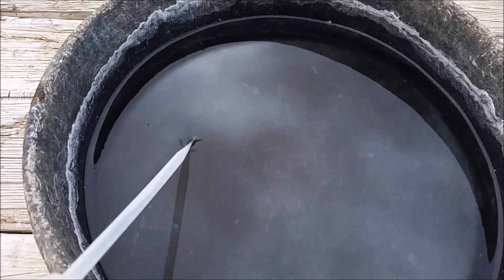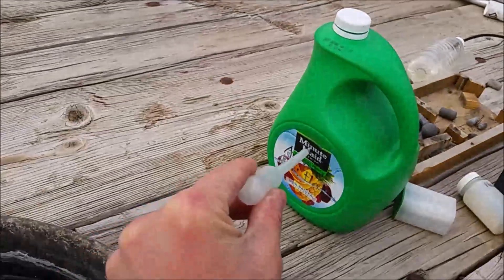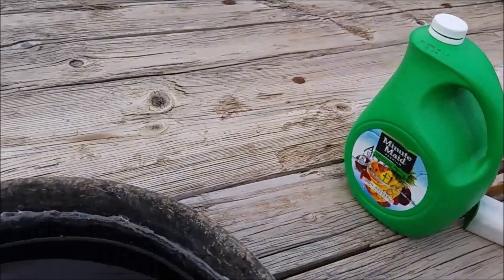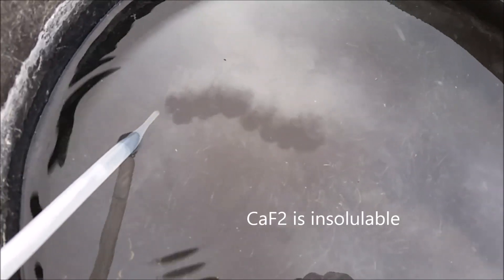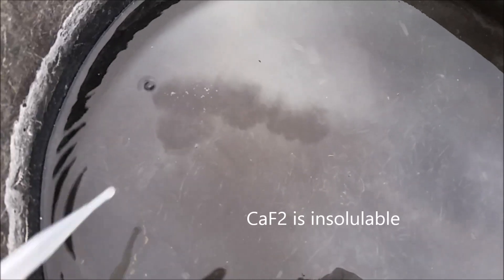You can see the solution that's left over here. I can reuse this, so I will put it in a jug — I've been using this thing here with the ammonium bifluoride written on it. You can actually see some white stuff that's come out. I think that's actually calcium fluoride, because there's calcium in the glass since it's a soda lime glass.